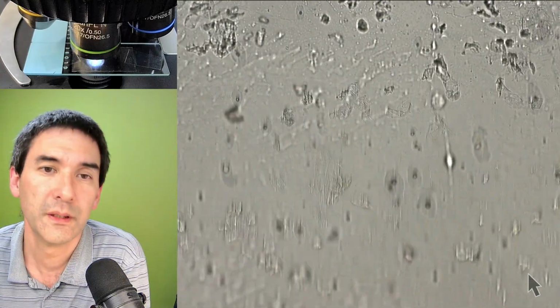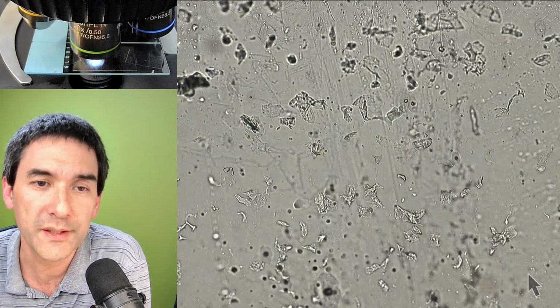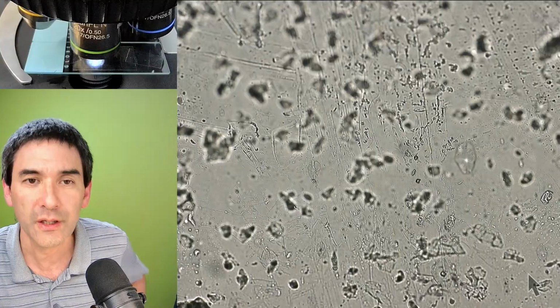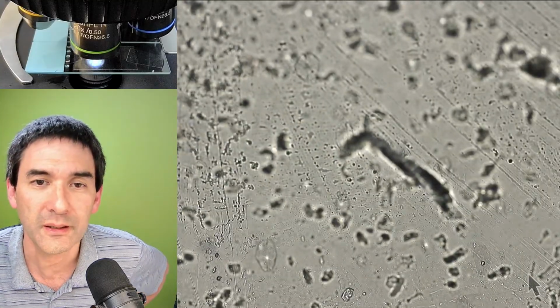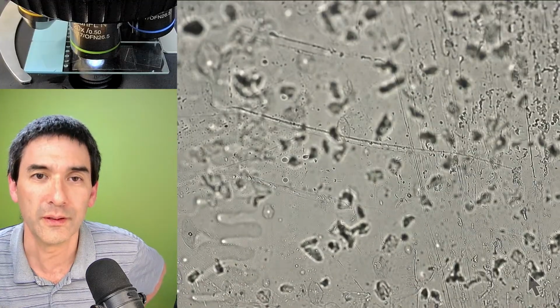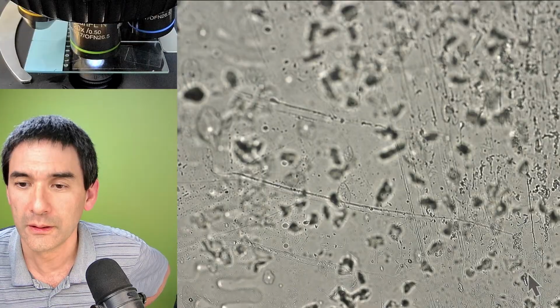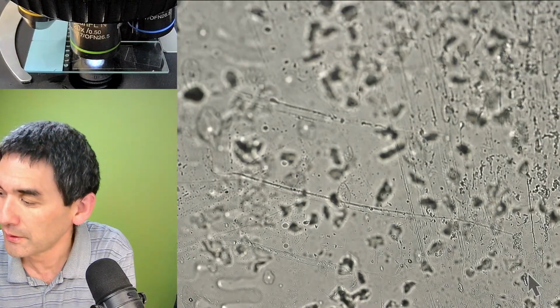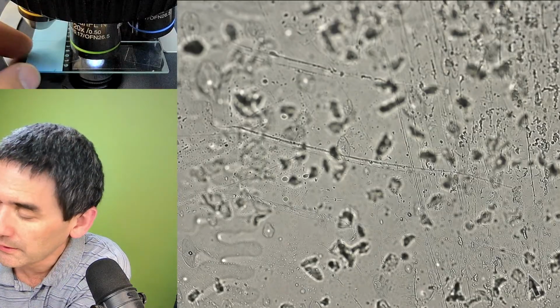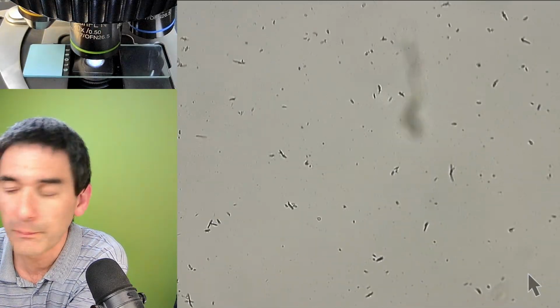Yeah, here, and then if we're lucky, we're able to find some again. Okay, so that's kind of the procedure, and now basically it's a question of trial and error until we're able to find a few more of them. Okay, so let's do the following. Let me quickly remove the slide again, and here we are back.